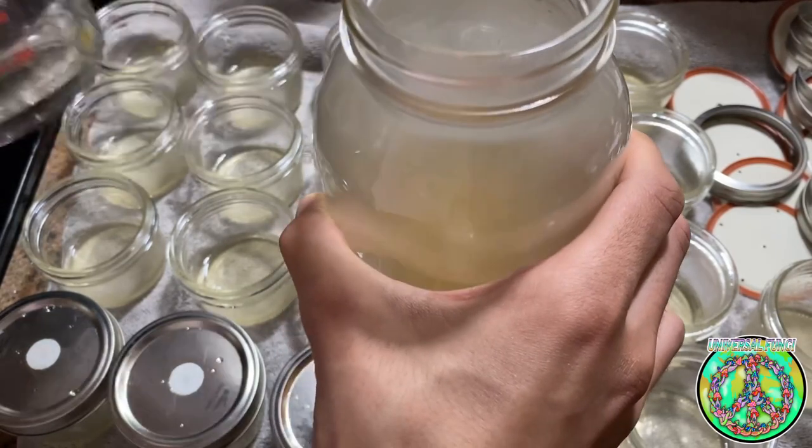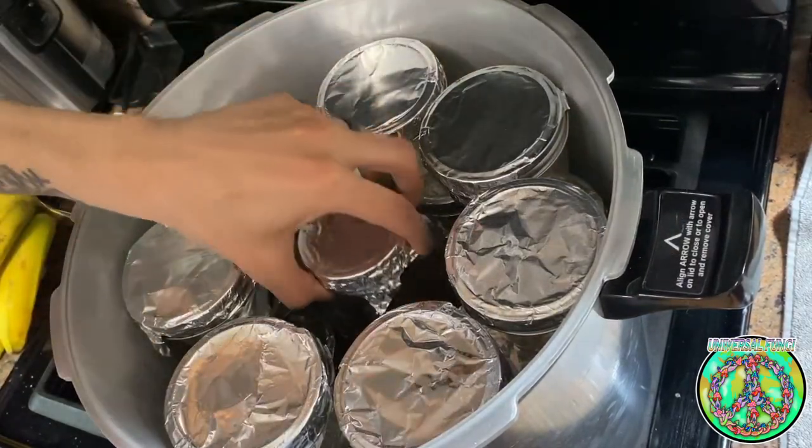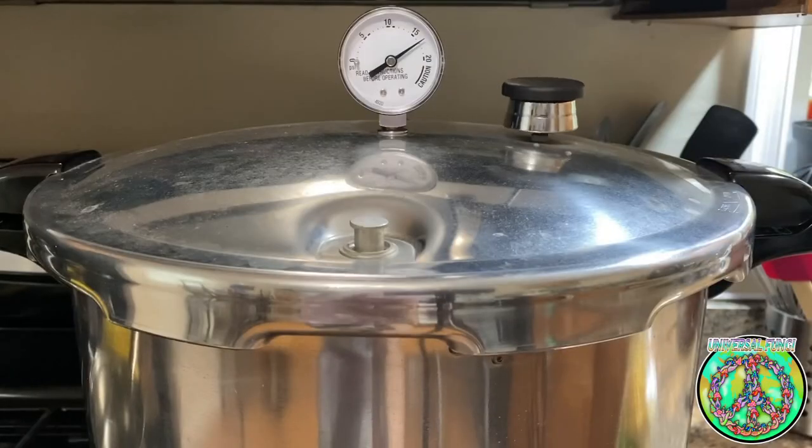After I poured all the jars, I went ahead and put all the lids on a quarter unscrewed to allow steam to vent and covered them with tin foil. Next, I load the pressure cooker up and pressure cook all this for 30 minutes.